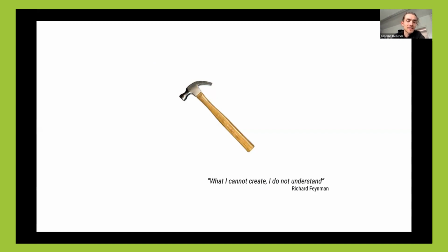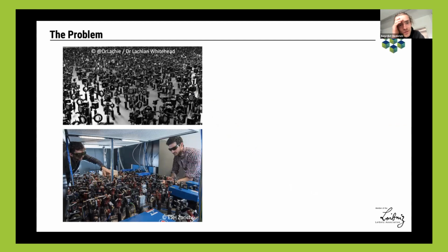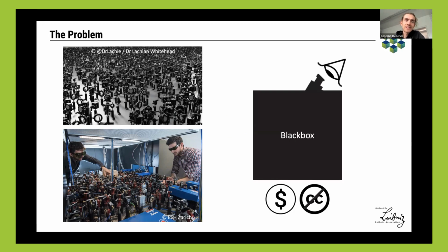But it also addresses serious issues. In many optics labs, you see this here. On the left-hand side, you see a rendering I picked up from Twitter, and an actual setup, which I think is for some quantum entanglement. However, I couldn't really follow the path, so it's becoming really difficult to replicate it. Microscopes, in a way, behave similarly. Somebody already mentioned it today, it's a black box, and you cannot really add anything once you bought it. That's kind of a bad thing.